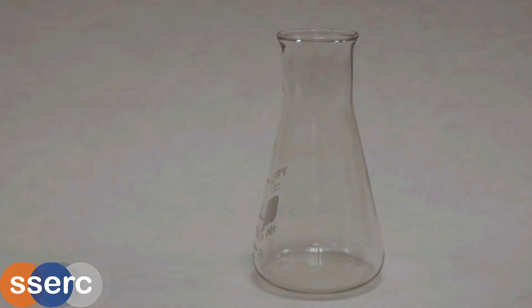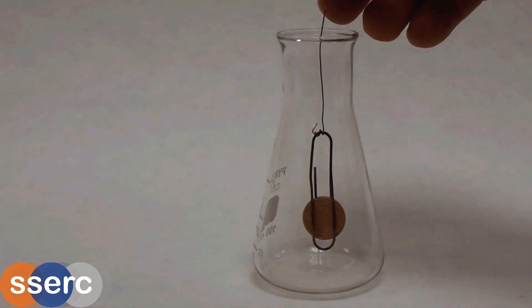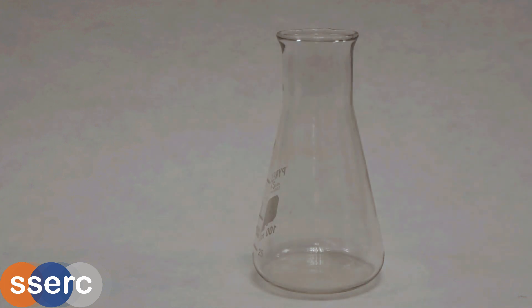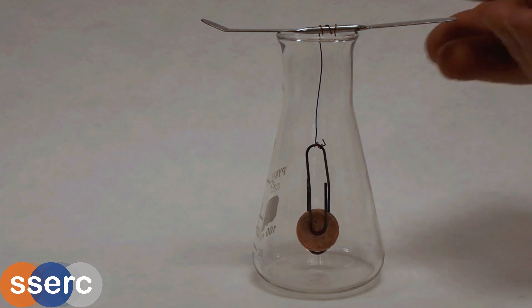You will need a small beaker or flask and you'll need to find some way of being able to dangle your coin just above the surface of the liquid. Here I am using a cradle made using a paper clip. This is then tied to a metal spatula with some wire and the length adjusted so it will dangle freely just above the liquid.